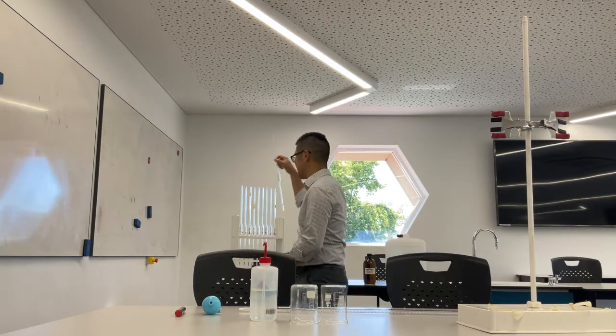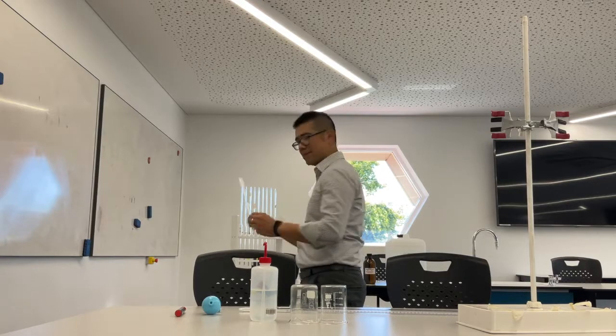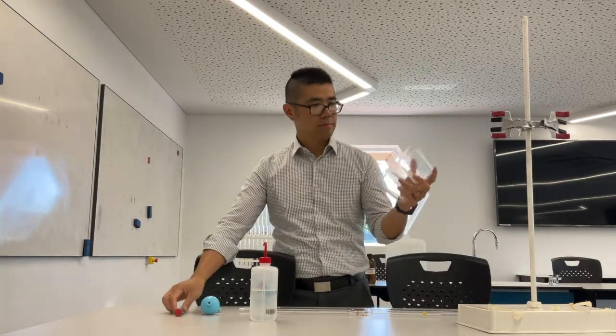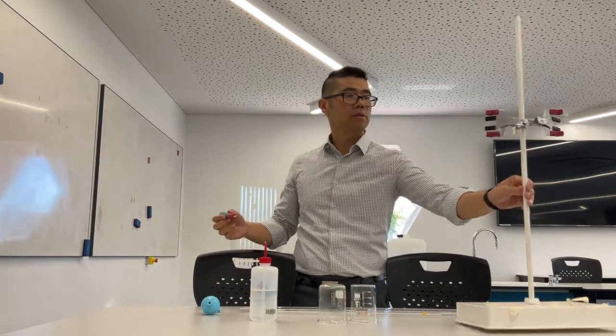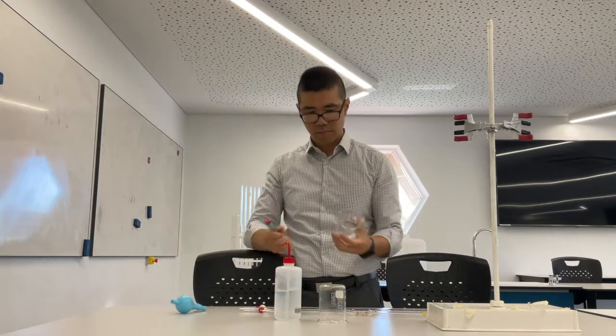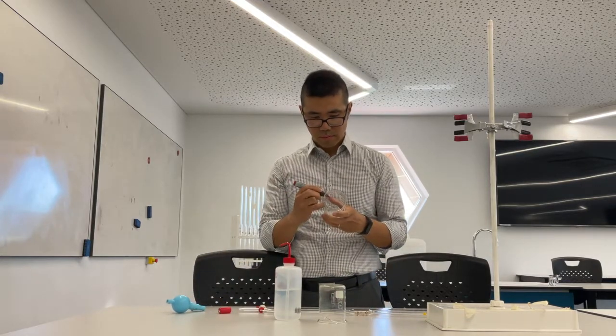So that was the burette. This is the pipette, and that's the pipette bulb filler. You need a couple of beakers, a whiteboard marker, a burette stand, distilled water, and a pipette filler. All right, let's get started.